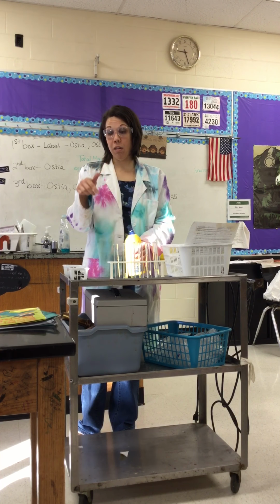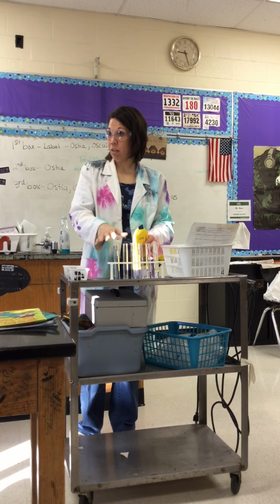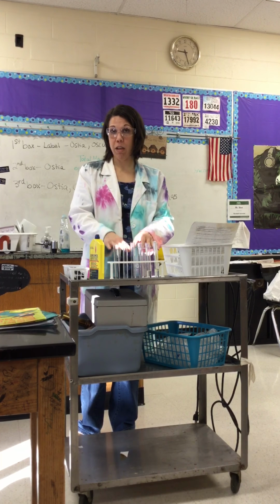We'll do that together, and we'll just call people to come up to the front here so we can keep the mess up here. That way we only have a little set of test tubes.